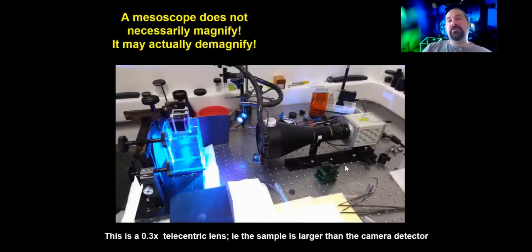The other thing I want to tell you about is the fact that very often, especially if you're dealing with late stage embryos, you don't want to do very high magnifications. In fact, you may actually want to do demagnification. You want to image something that's larger than your chip, the chip on your camera.